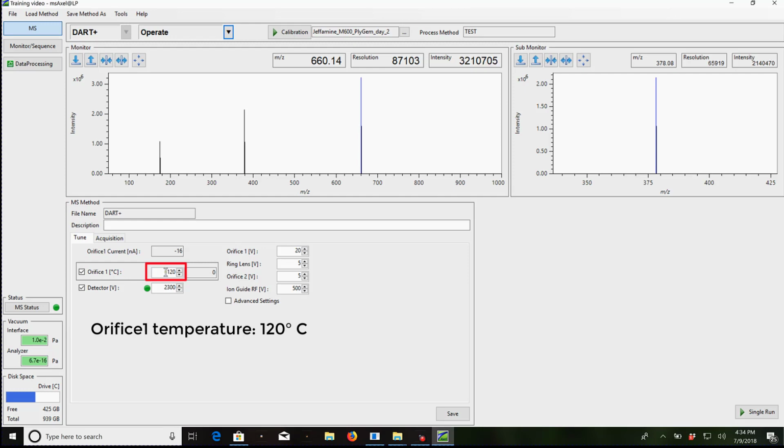That keeps the orifice clean, and it also causes the metal to expand a little bit and shrink the diameter of the orifice so that it isn't pumping quite as much helium and doesn't stress the vacuum system too much.